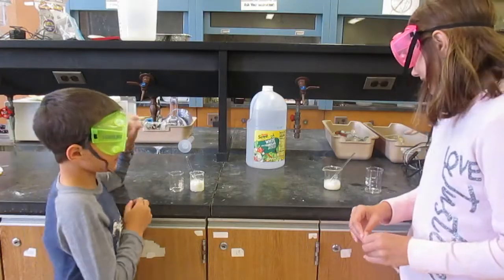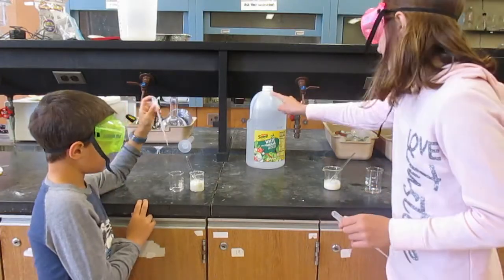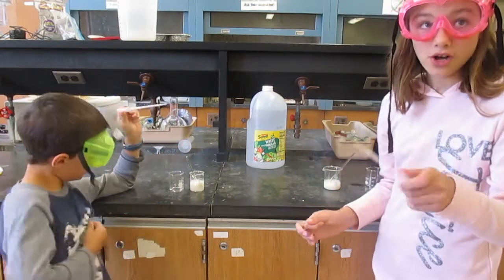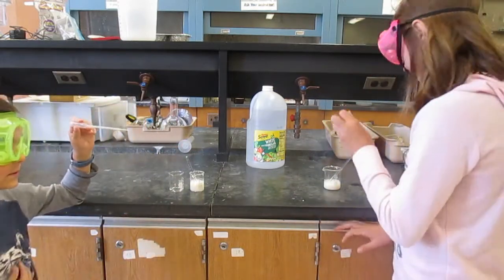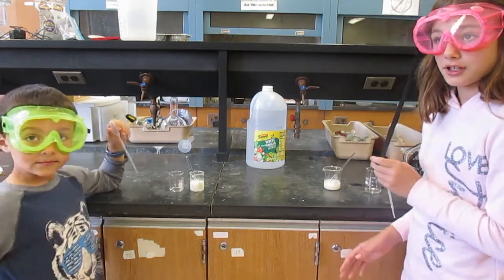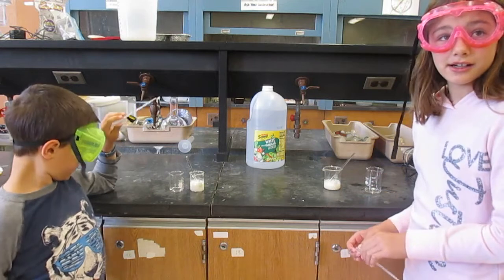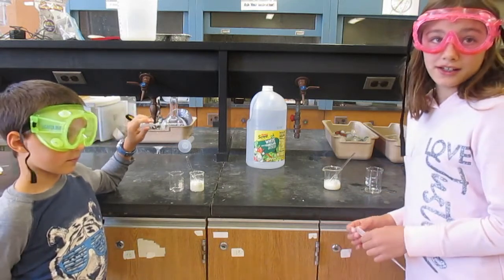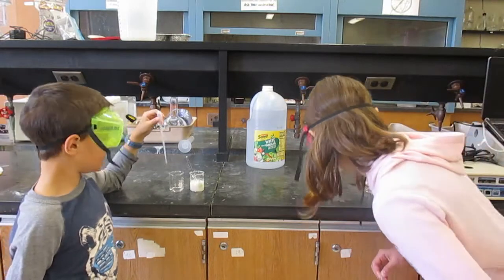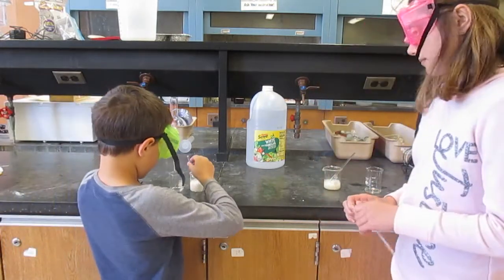Okay. So you're going to have to put some white vinegar into your milk-like solution drop-wise until it's almost clear-like. And how much vinegar do you think you're going to have to add? About 10, I think. No, 5. No more than 5, right? Yes. Are you going to have to stir it while you're doing this? Yes. Okay, so let's see you kids do this then.